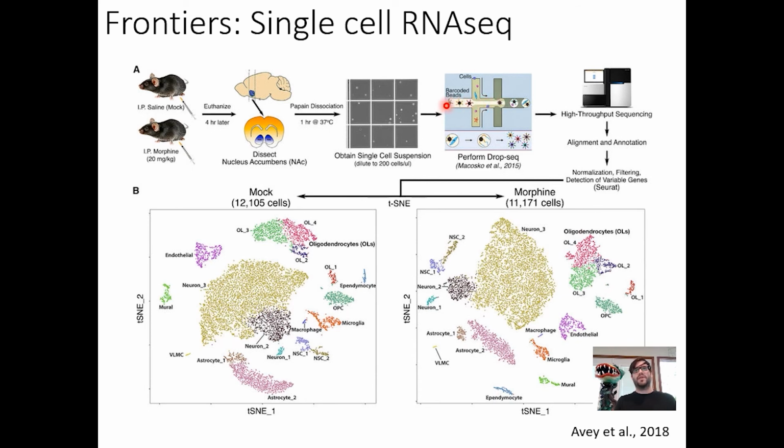What we're basically doing is creating tiny droplets where ideally we want a droplet that has a single cell from our organism and a single barcoded bead, and then you'll have a bunch of ones that don't have either of them. Then we make a tiny RNA-seq library in each one of these individual droplets, and then we sequence those, and because each droplet has its own adapter or barcode, we can then identify them as individual cells.